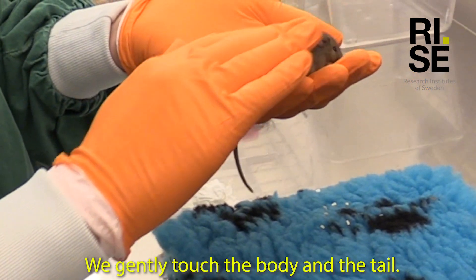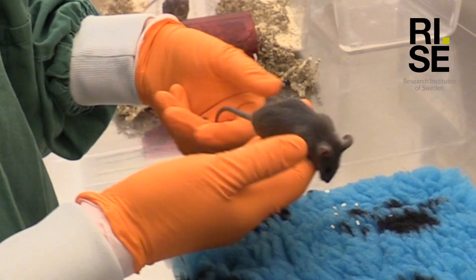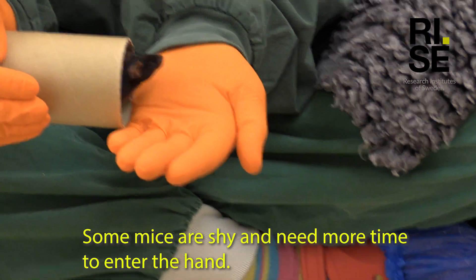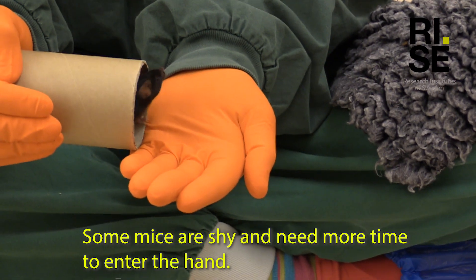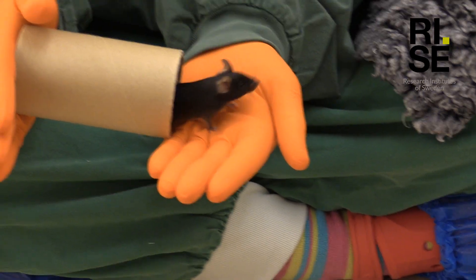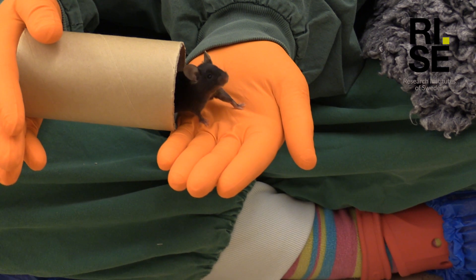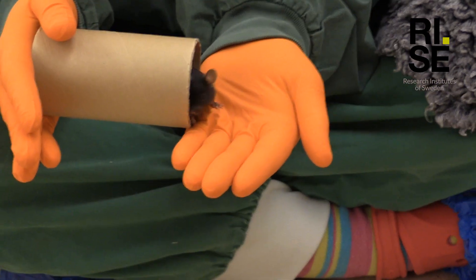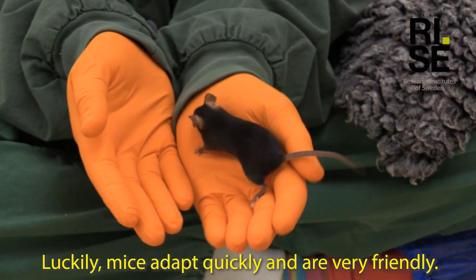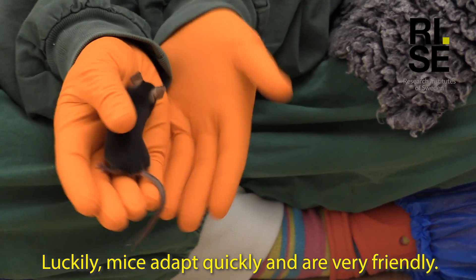We gently touch the body and the tail. Some mice are shy and need more time to enter the hand. Luckily mice adapt quickly and are very friendly.